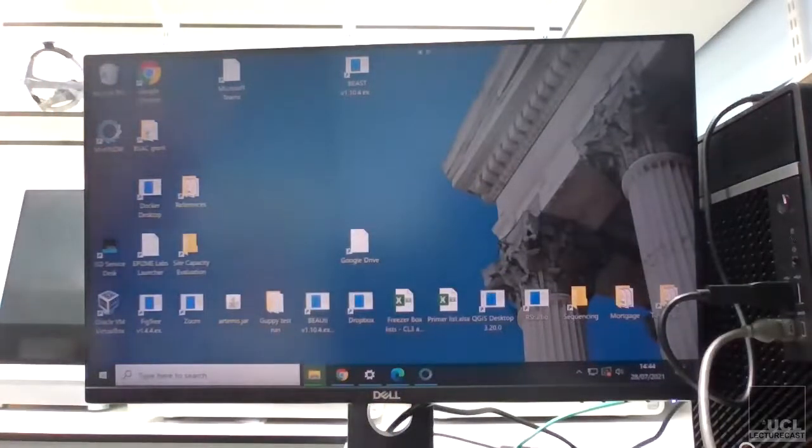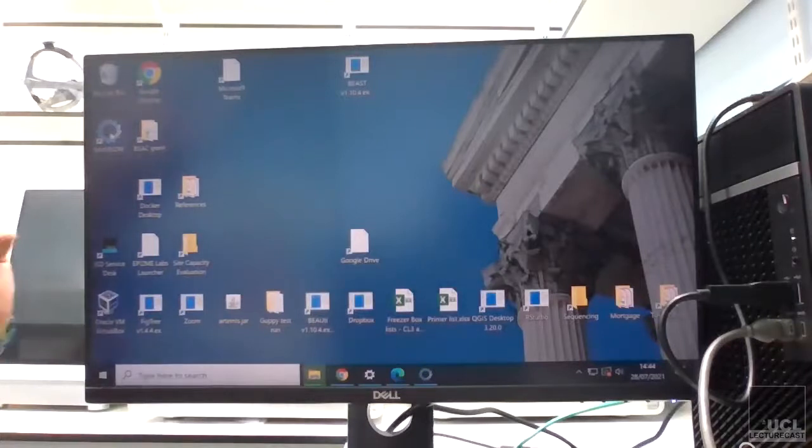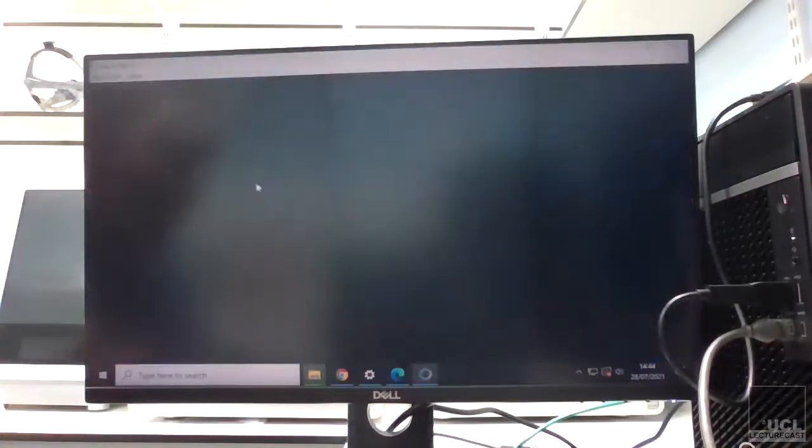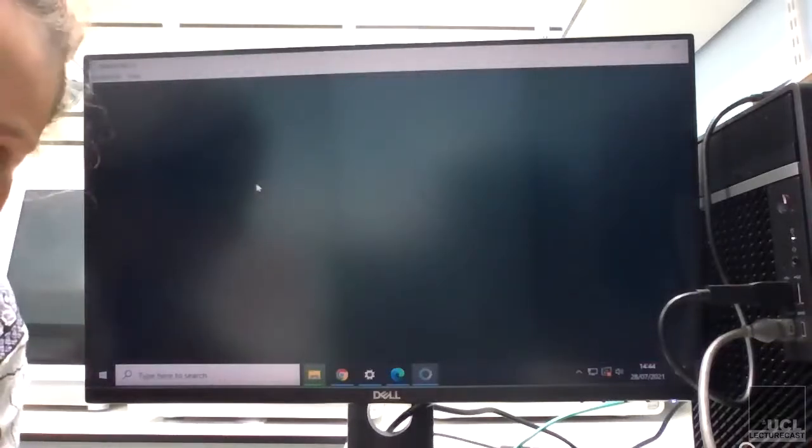Now by my mouse I'm going to go into my MinION software. As you've got a Mark 1C, you probably don't have to do that, but hopefully this will load up.